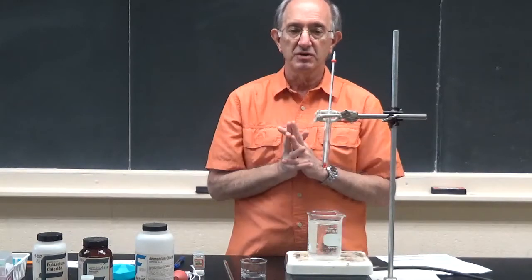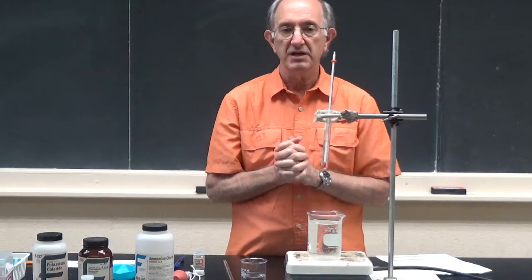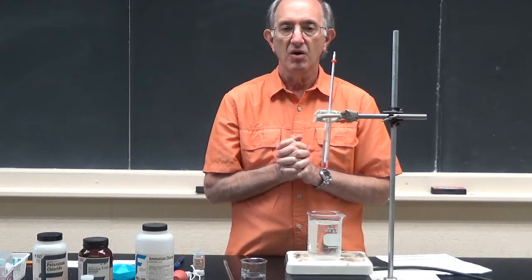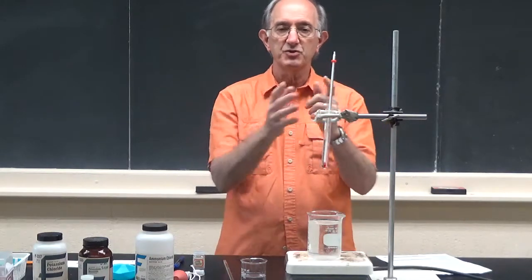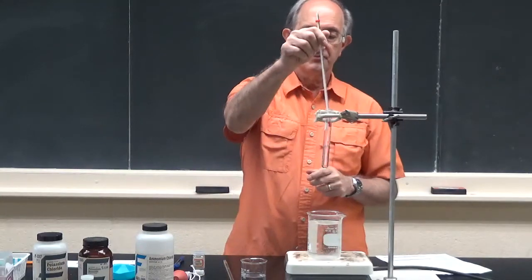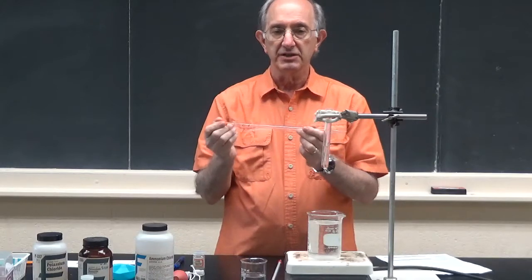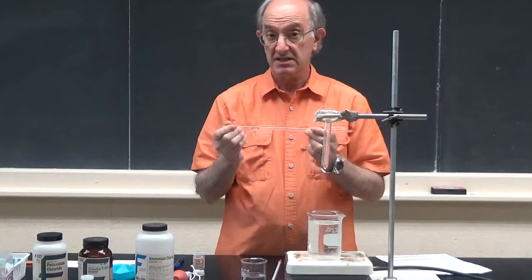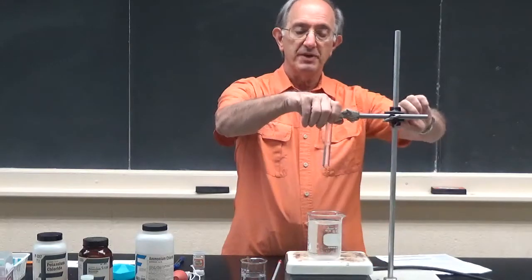So you're going to do one, maybe two, a second repetition of this, depending upon the time. And Dr. Shane and I will tell you next week whether we'd like you to repeat this or not. So let's just assume you do this once. You're then going to add 1 additional milliliter, up to 6 milliliters, 1 plus 5. And you're going to repeat this.